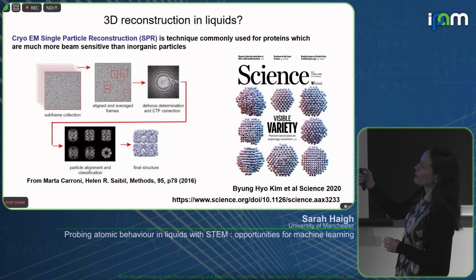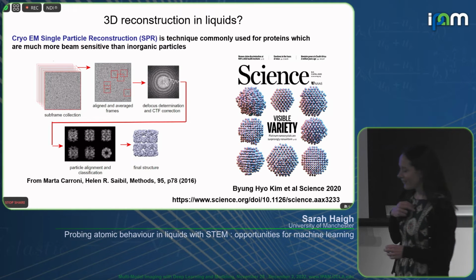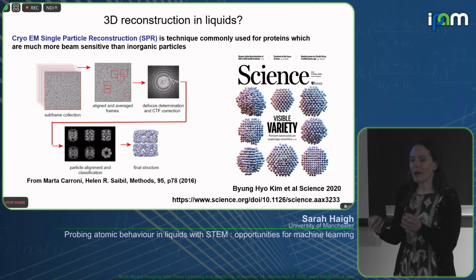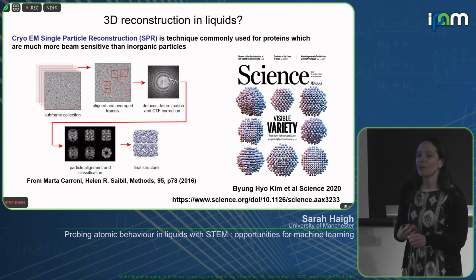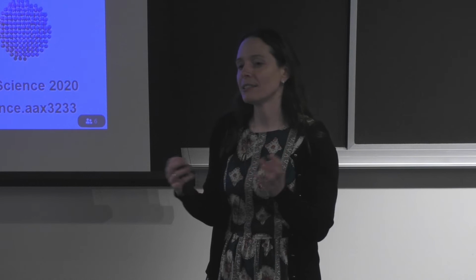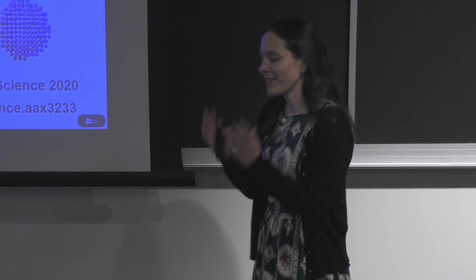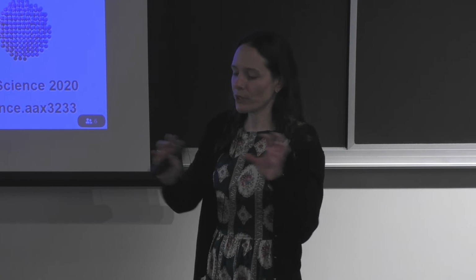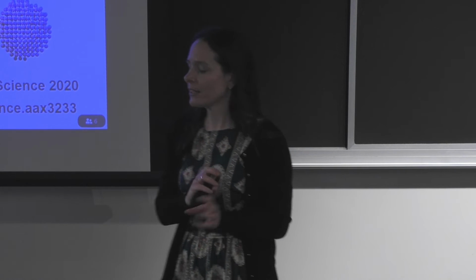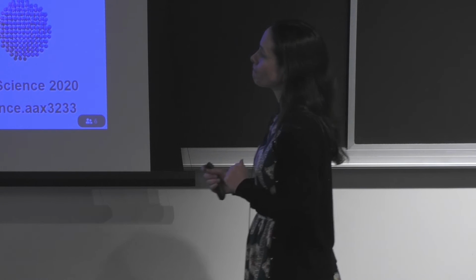And the single particle reconstruction approach is extremely badly named in my opinion, because it is anything but a single particle that you are studying. What you are typically studying is millions of individual proteins or objects, whatever it is that you want to study, and you are assuming they are all the same. Okay, and that is, even in biology, not a very good assumption in lots of cases, and there's some very clever work to segment and work out which of the different classes within the different protein structures to understand different conformations.